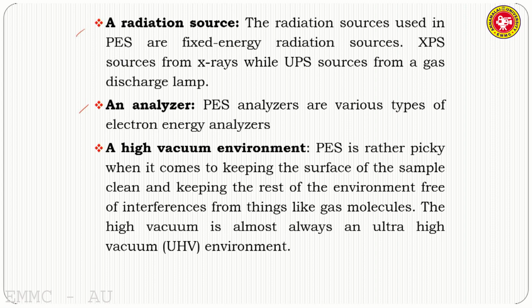Next, a high vacuum environment. PES is rather picky when it comes to keeping the surface of the sample clean and keeping the rest of the environment free of interference from things like gas molecules. The high vacuum is almost always an ultra-high vacuum environment.